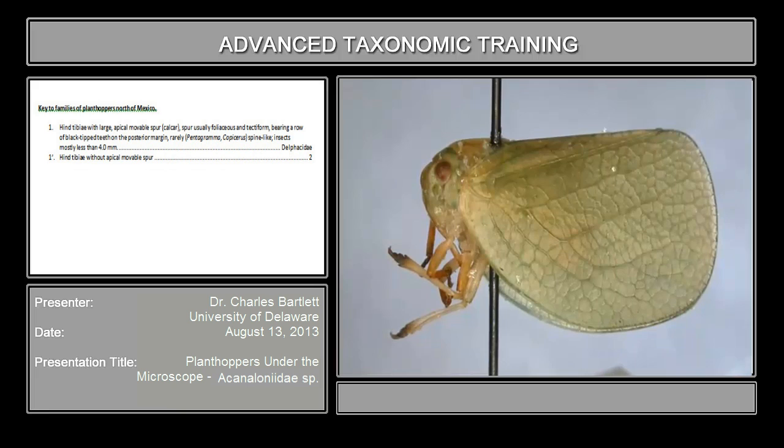Let's move on to a specimen that looks like this. And I choose this specimen and this family because it is one that's frequently identified in error, and we might as well compare it directly with the family Flattidae.